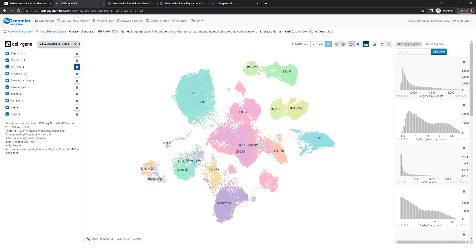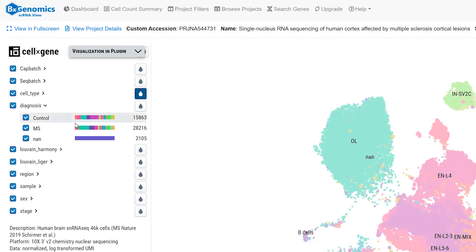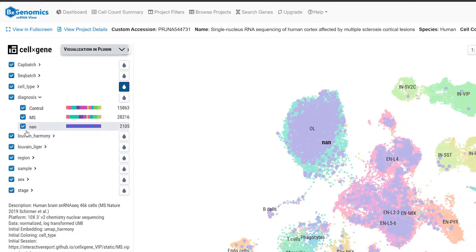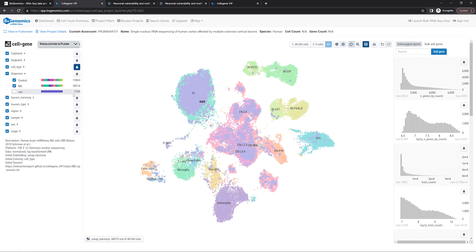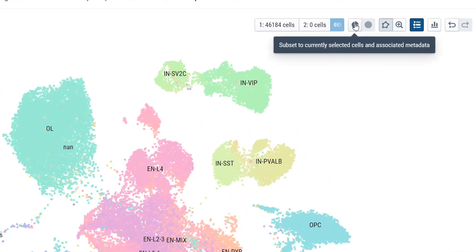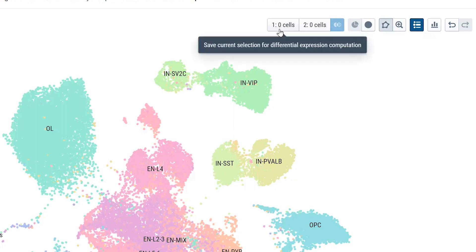From the diagnosis annotation, we can see the cells are from either MS patients or control, and we'll deselect the about 2,000 cells without diagnosis information. Next, click the Pi button to set it to selected cells only, and we can save the selected cells to slot 1.